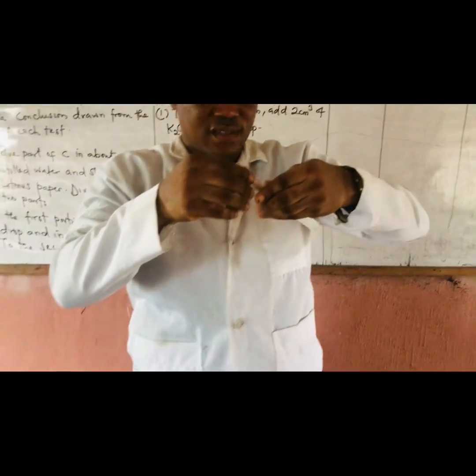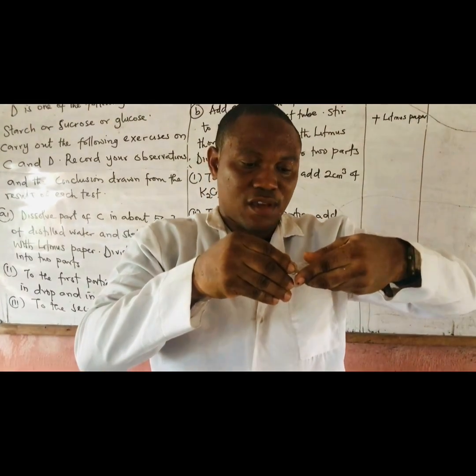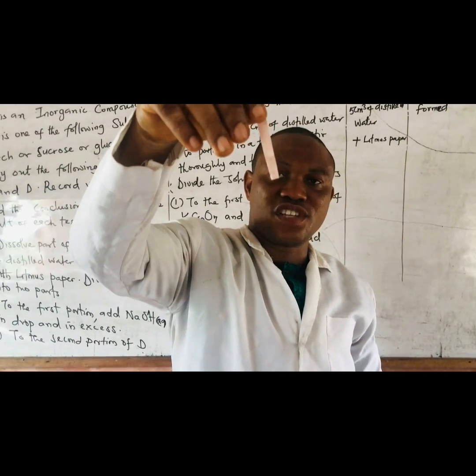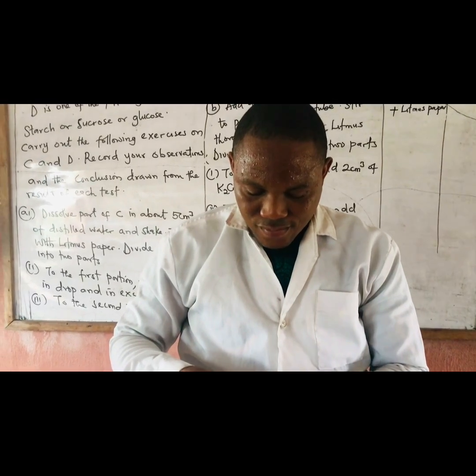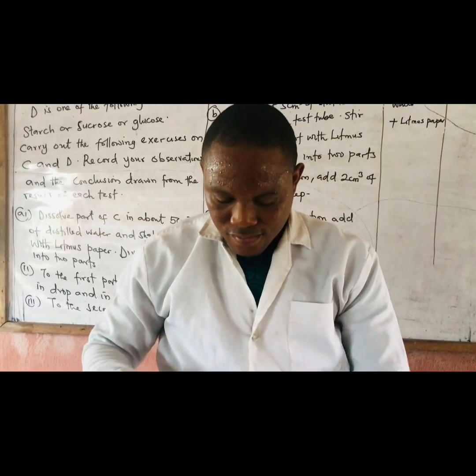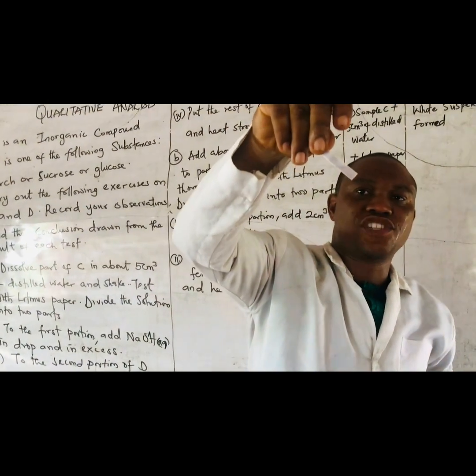The red. Okay? No effect, it's not changing my red. Can you see that? So let me see my blue. You can see, it's not changing my blue too.